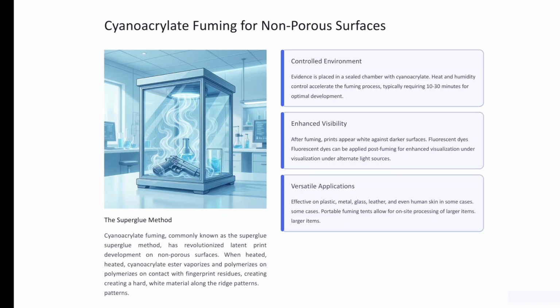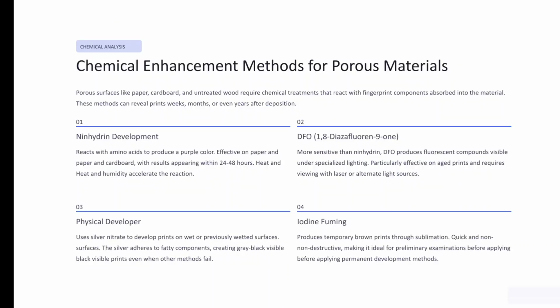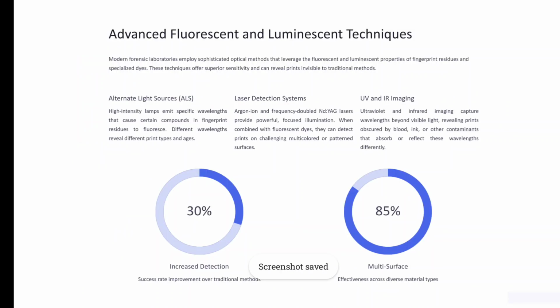DFO, diazafluorenone, is also powerful, making fingerprints visible under specialized lighting, particularly effective with alternative light sources. Optical methods use advanced imaging without physical contact.